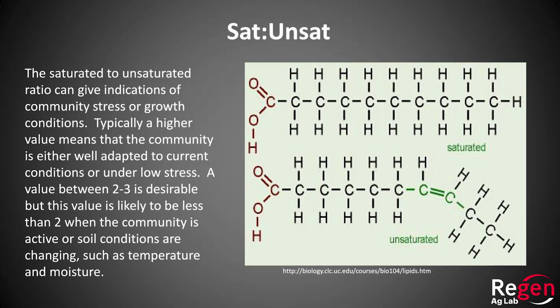This one I did not talk about today, but it's a fun one because when I told you that we're extracting fats, how many of you have heard of saturated fat? Unsaturated fat? There you go, you understand that. That is what we're doing. We're measuring saturated versus unsaturated fats.